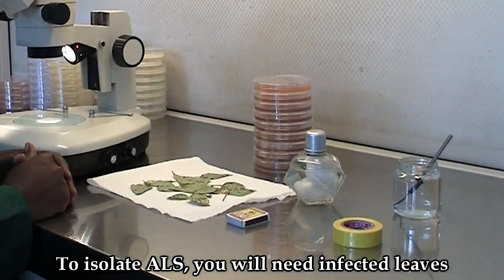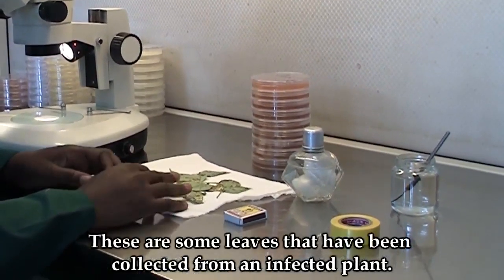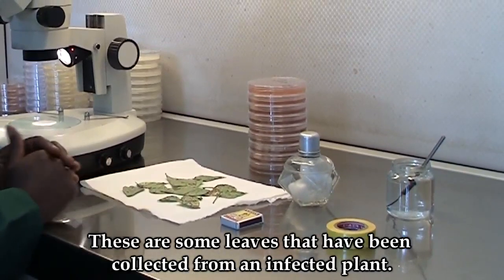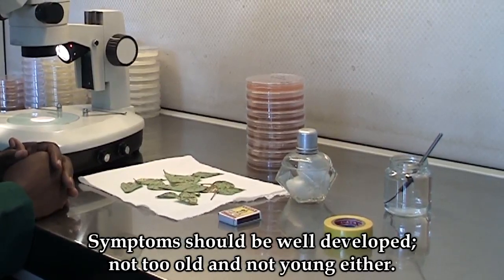To isolate angular leaf spot, you will need infected leaves. These are some leaves that have been collected from an infected plant. The symptoms shouldn't be old, but they shouldn't be young either.